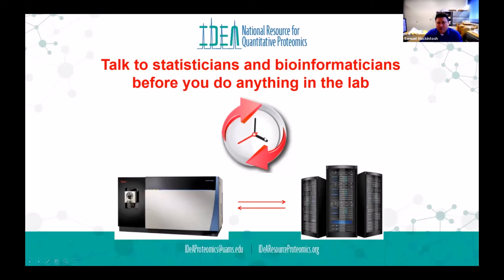Other questions are things like post translational modifications. I think I have a slide on that here in a minute. If you're looking for changes in phosphorylation, you need to let the proteomics people know that before all the data are generated, because we do the experiment differently if we know that you're looking for something like that.